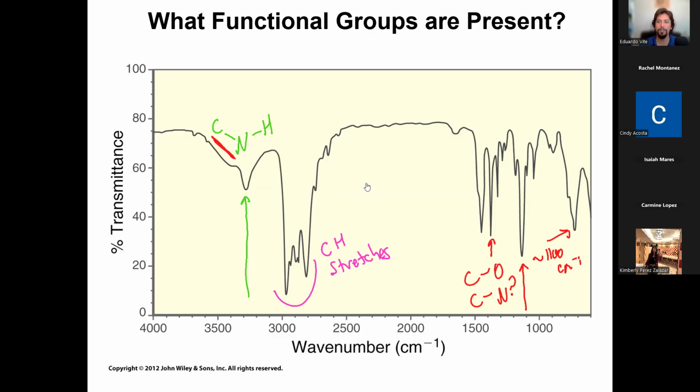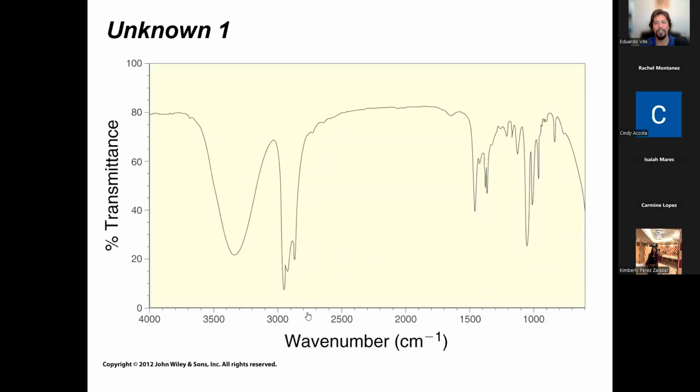So, any questions so far? Is this kind of making more sense? Like the logic, how do you attack these problems? What do you ask yourself? If you always look for the carbonyl and it's not there, that's already a big step forward, I would say. So, all right. Yep, and then here's another example. This one should be a little more familiar to you now.